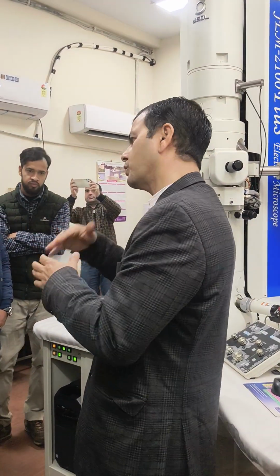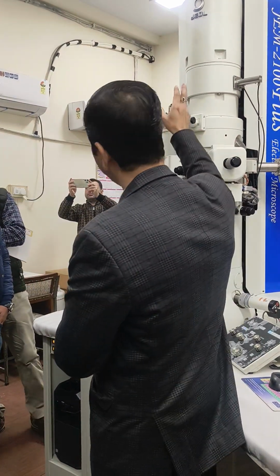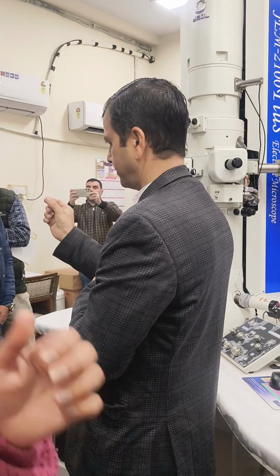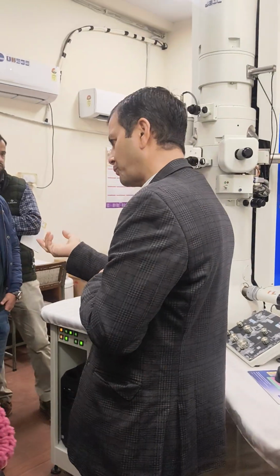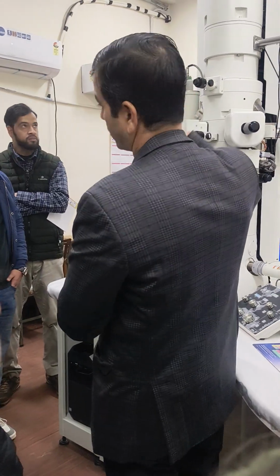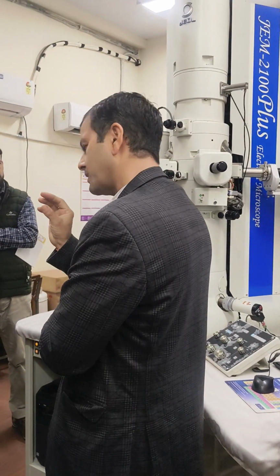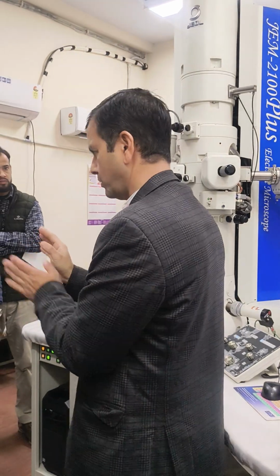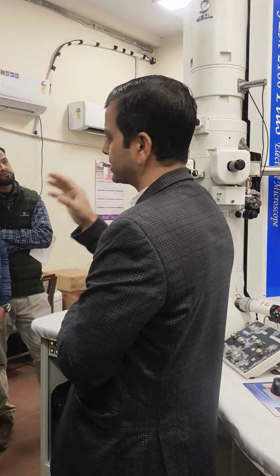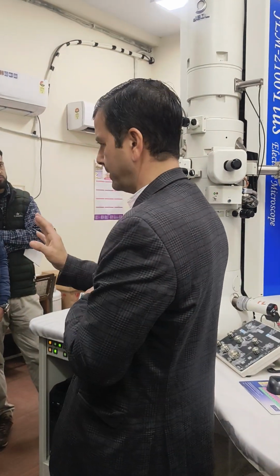And again, as I told, cost is going to add. After 200 kV, again the filament, we are talking about filament. Just like we purchase a simple electric bulb with tungsten, 12 rupees, 50 rupees, and a CFL or other fluorescent bulb costs in the hundreds. So the same tungsten filament is there, its cost is maybe 1 crore at 120 kV. When we say LaB6, lanthanum hexaboride filament, the cost is around 4 crore at 200 kV.